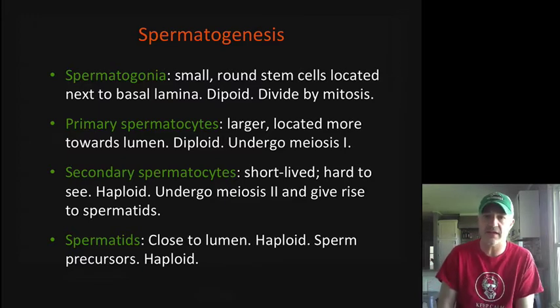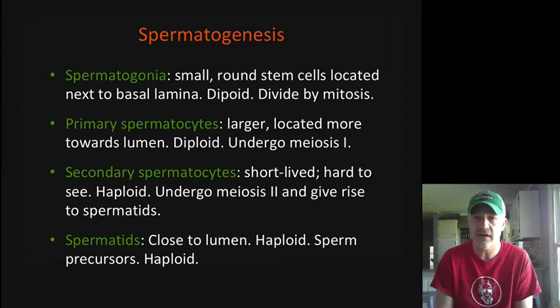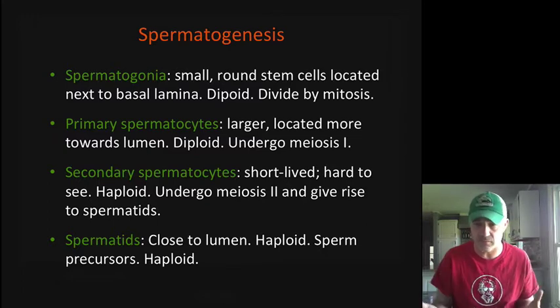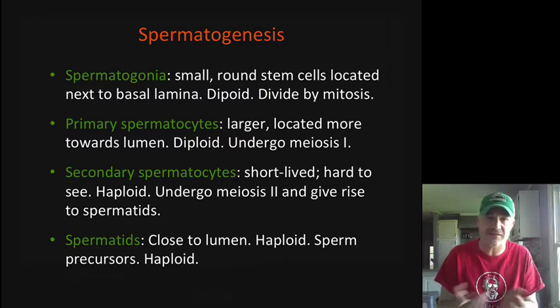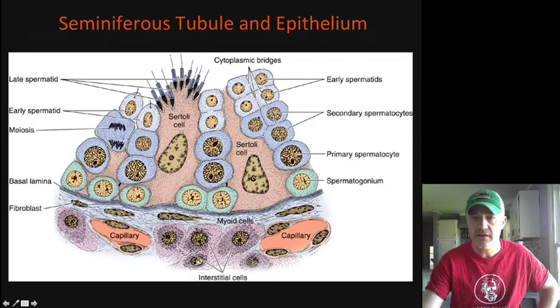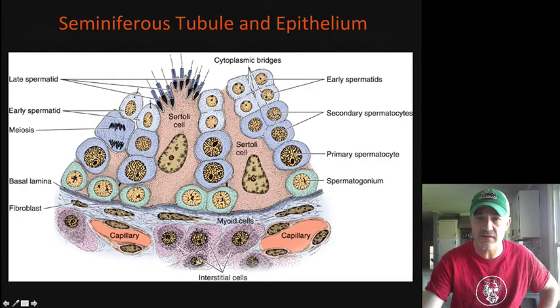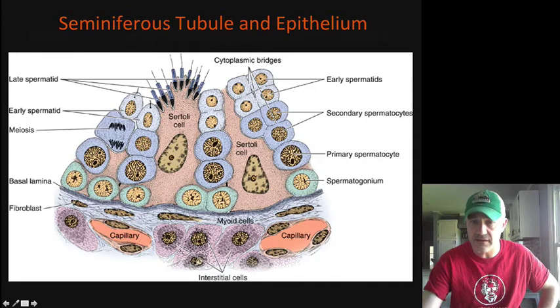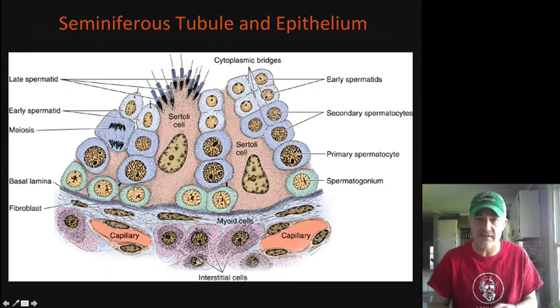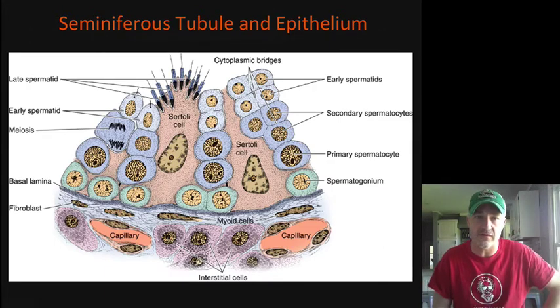The spermatogonia are those round stem cells up near the surface by the basal lamina, and they undergo mitosis. We then get to the larger primary spermatocytes more towards the lumen, and secondary spermatocytes — both in different stages of meiosis. As we get to the lumen you have the spermatids, which are the haploid cells that just need to finish their external development to become functioning spermatozoa. You can see the nucleus condenses down into the head of the sperm cell — those are the late spermatids that become spermatozoa during spermiogenesis.